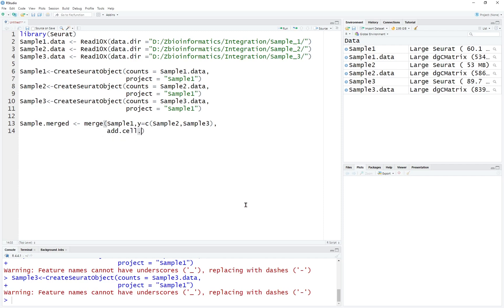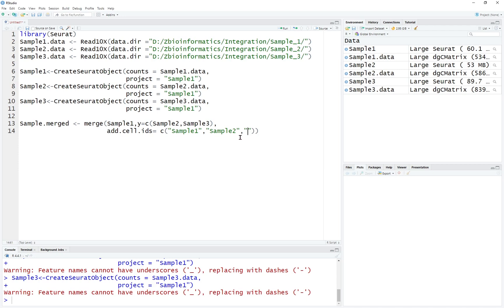So we're going to use add.cell.ids. The first one is going to be sample 1's name, the second one sample 2, and the third one sample 3. We're going to rename the whole project and give the project the name sample integrated.